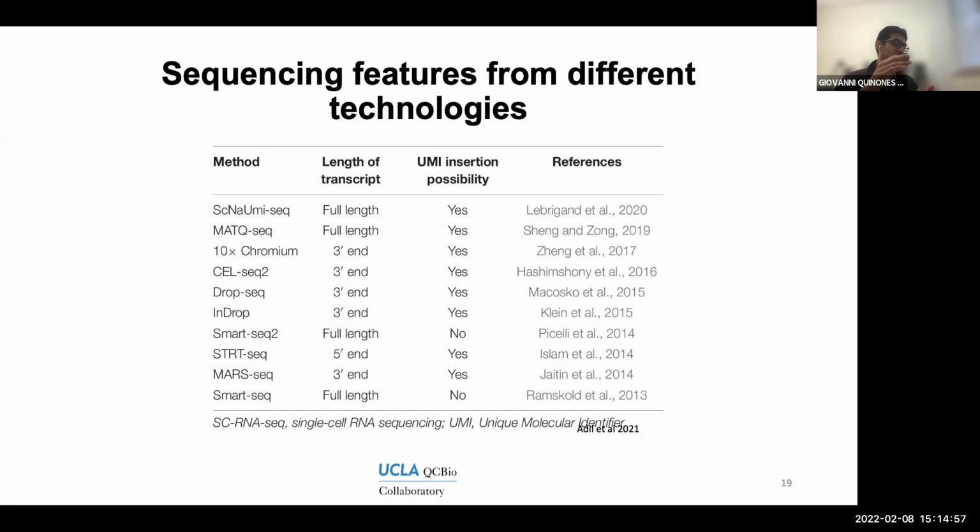Events such as whether your transcript is being spliced or not, whether it's using an alternative initiation or an alternative termination point, you can learn all these different features about RNA that go beyond gene expression. These are unrelated to gene expression, but I think it's worth highlighting the fact that single cell is not limited to only gene expression. Okay.